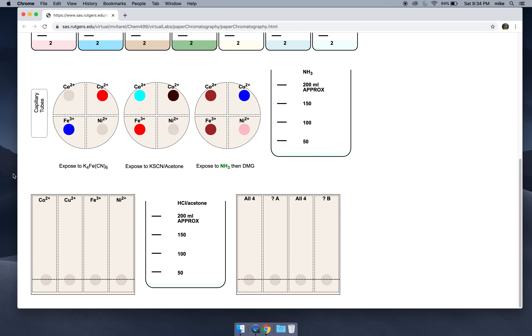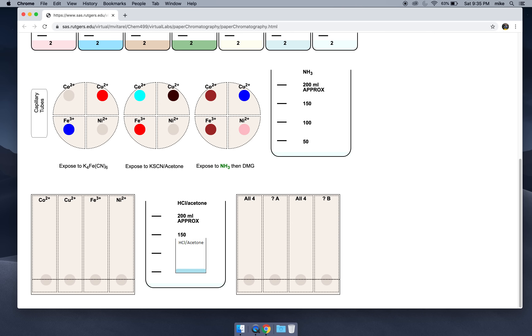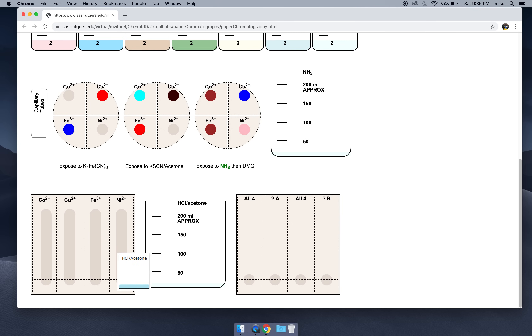In the lab, you would take this piece of paper, put it into your beaker with your mobile phase, and then put some kind of lid or dish over this so that there's a dynamic equilibrium of the liquid phase and the gas phase so that the paper is saturated. This is 90% acetone, so if the lid wasn't on, as the solution moves up the piece of paper it would rapidly evaporate. The lid prevents this from evaporating rapidly. Since we're not in the lab, we'll click on this, get our HCl acetone, and move it over our piece of paper to see our solvent front move up.